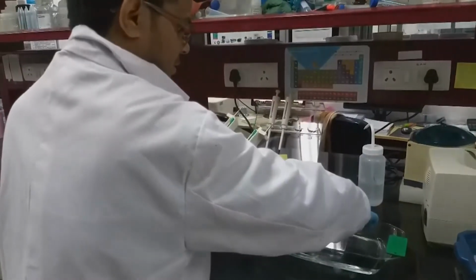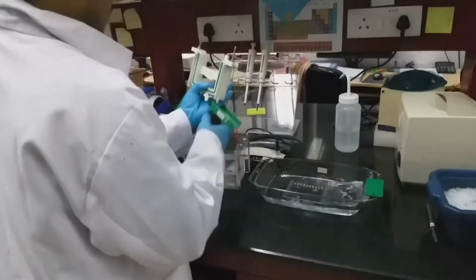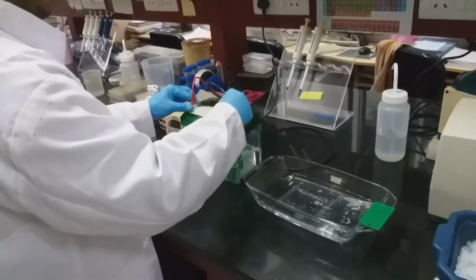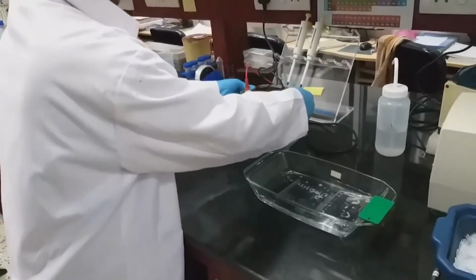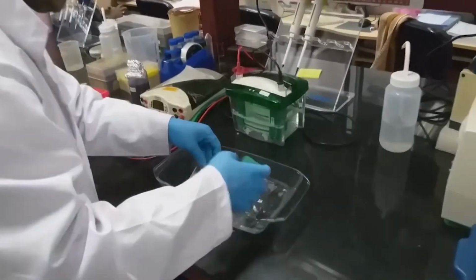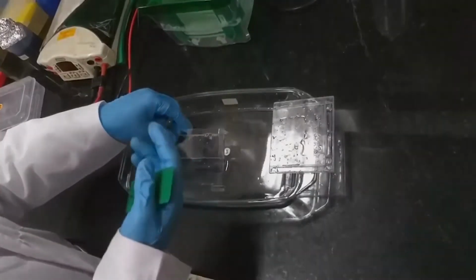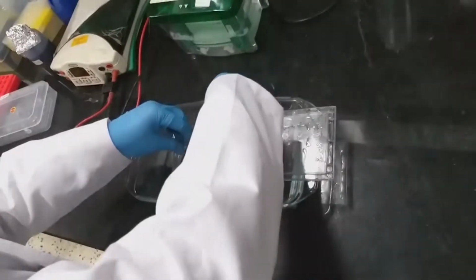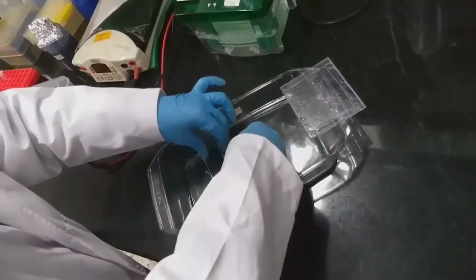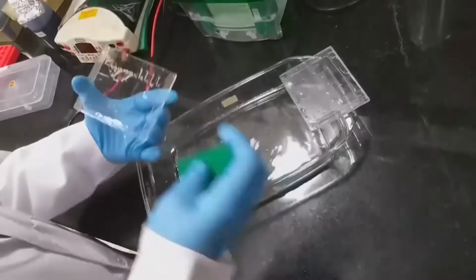Take out the glass plates. Here we have to be very careful while taking out the gel, otherwise the sharp plates may break. On a corner we have to take and lift the gel like this.